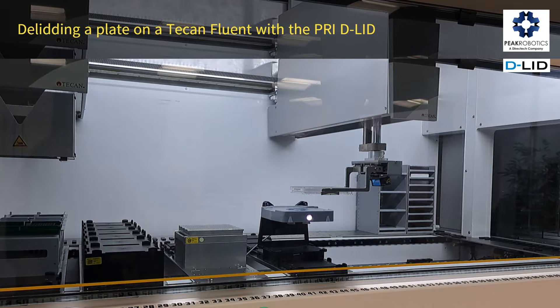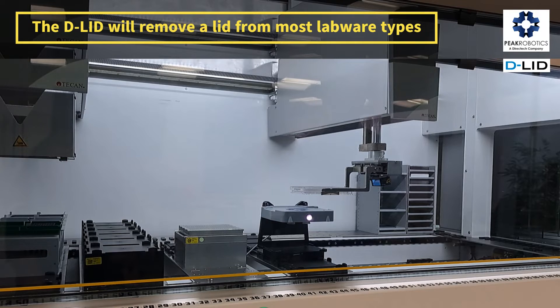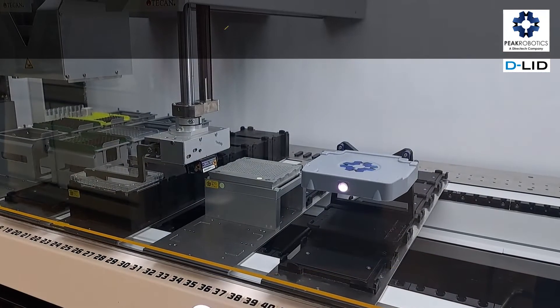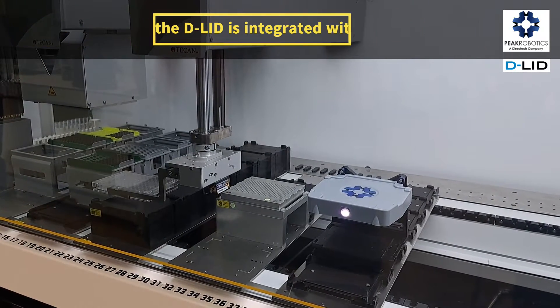Delidding a plate on a Tecan Fluent with the PRI D-Lid. The D-Lid will remove a lid from most labware types. In this example, the D-Lid is integrated with a Tecan Fluent.